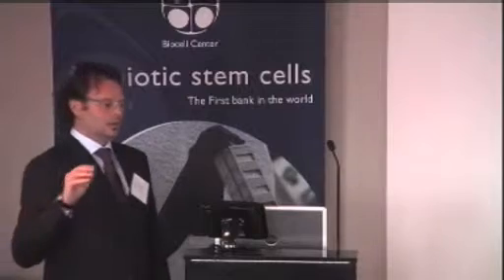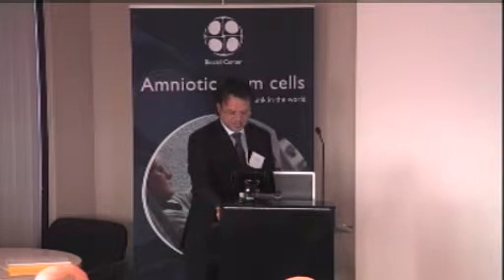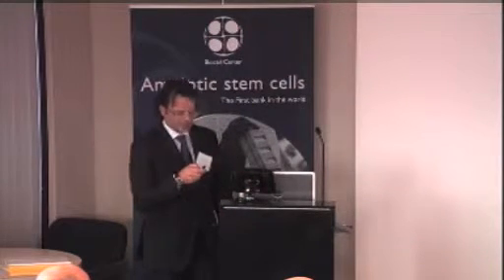I will try to give you a definition of the isolators and their use, the business unit of Synthetica, the requirements for stem cell manipulation, and the development of an isolator that could meet these requirements. And at the very end, the Celli isolator, which is the result of this project. So let's start with the isolator.